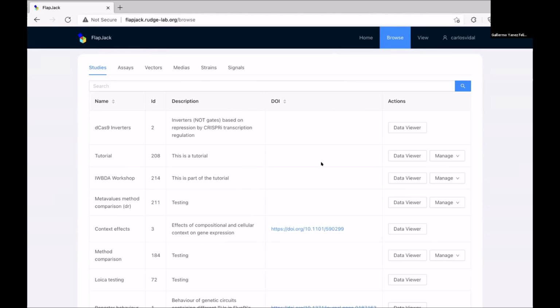Yeah, actually, as Gonzalo replied in the chat, he's got a project of 4.5 lab, which is basically imagine you having a tablet with an application that allows you to connect to different machines or software, and basically controlling your lab by the Internet of Things. That's more like 5.0. That would be amazing. That's further than what I'm asking. But yes, I think the world would just be Flapjack, and you would just have one giant lab that operates inside of it. But controlling a lab from a tablet, I didn't think that would happen until my next decade. So it's all ahead of the curve.